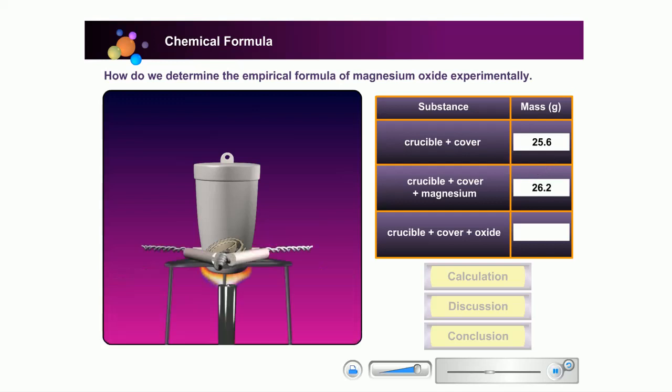Heat the crucible over a strong flame. Lift the crucible cover once in a while to allow oxygen to react with magnesium. Keep the crucible cover close when the magnesium begins to burn. This is to prevent the white fumes of magnesium oxide from escaping.